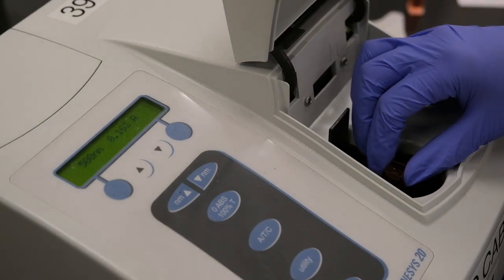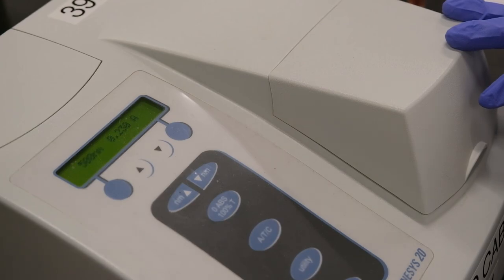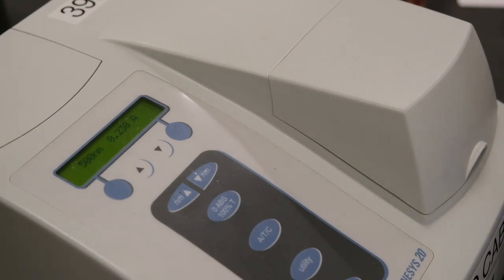Should I say not to use these points to make your graph? Mm-hmm. Okay. And unknown? Oh, the unknown is unrelated. Okay, fine. Okay. So now use all these points to make your graph. Now use this data to make your graph. Now use all this data to make your Beer's law plot.